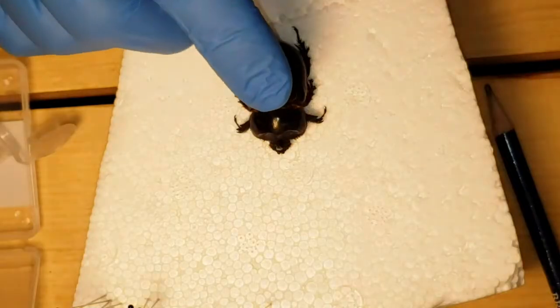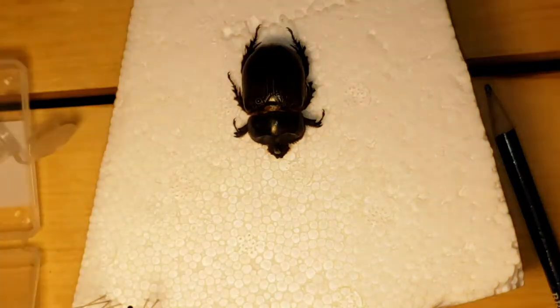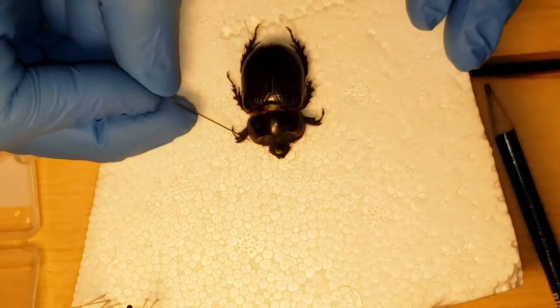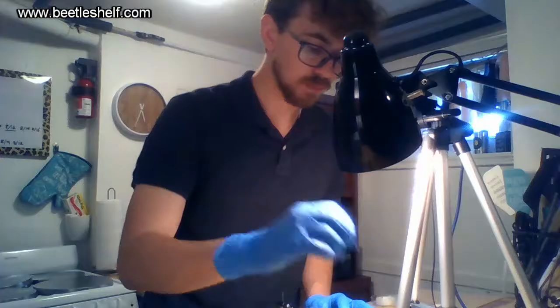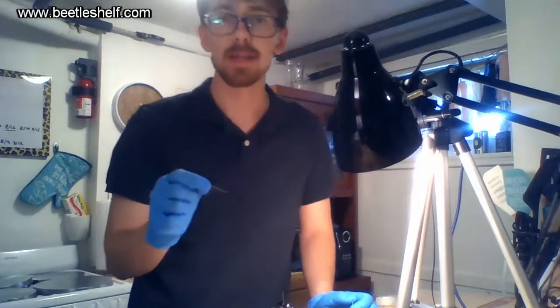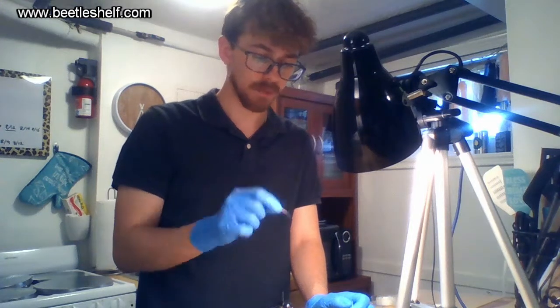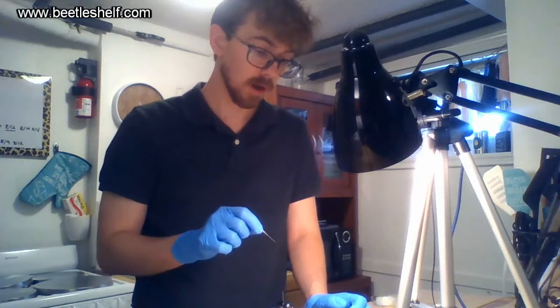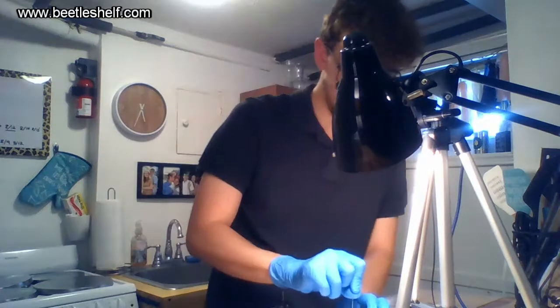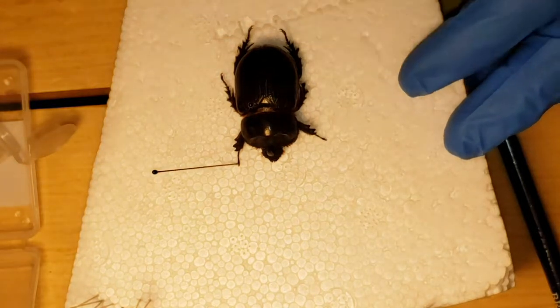After you have him laid out, let's put his front arms out first. I take a pin and kind of drag out just the front arm and put it right there. You don't put any pins through the bug except for the first pin that goes through the top right of the elytra — all other pins just hold things in place.